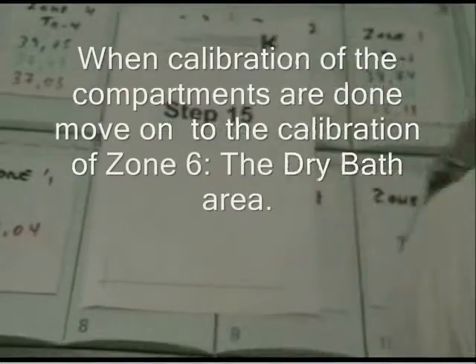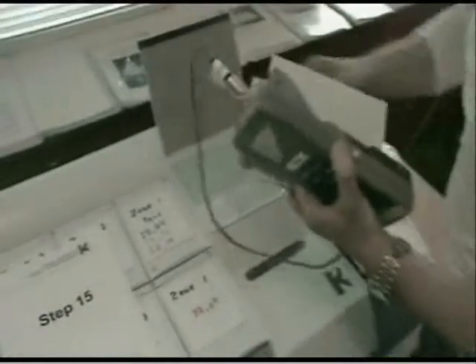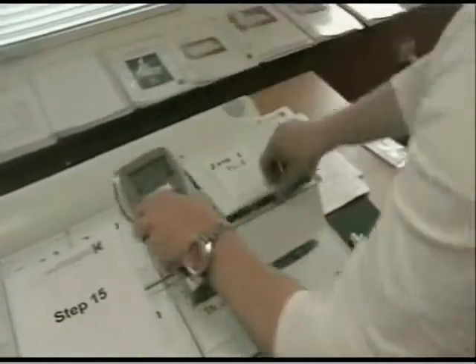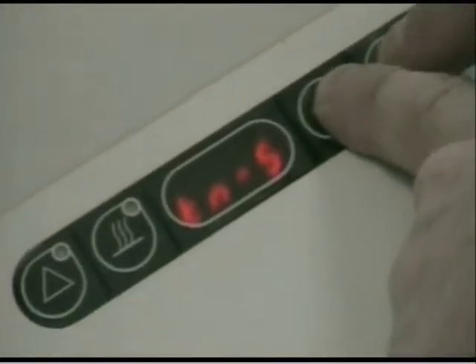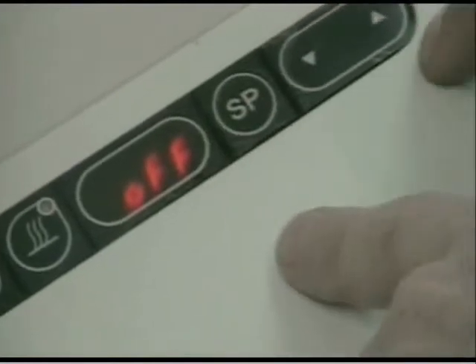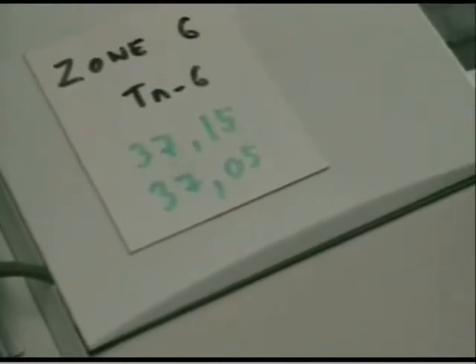We have calibrated the unit completely for zones 1 to 5 and confirmed acceptable lower compartment temperatures. Now we move on to calibrate zone 6. We place the sensor inside it, close it, wait until the temperature stabilizes, and write down the measurement. We have a value of 37.15, so we go into the menu, find tune 6, and adjust it. After calibration, the value is 37.05, which is acceptable.